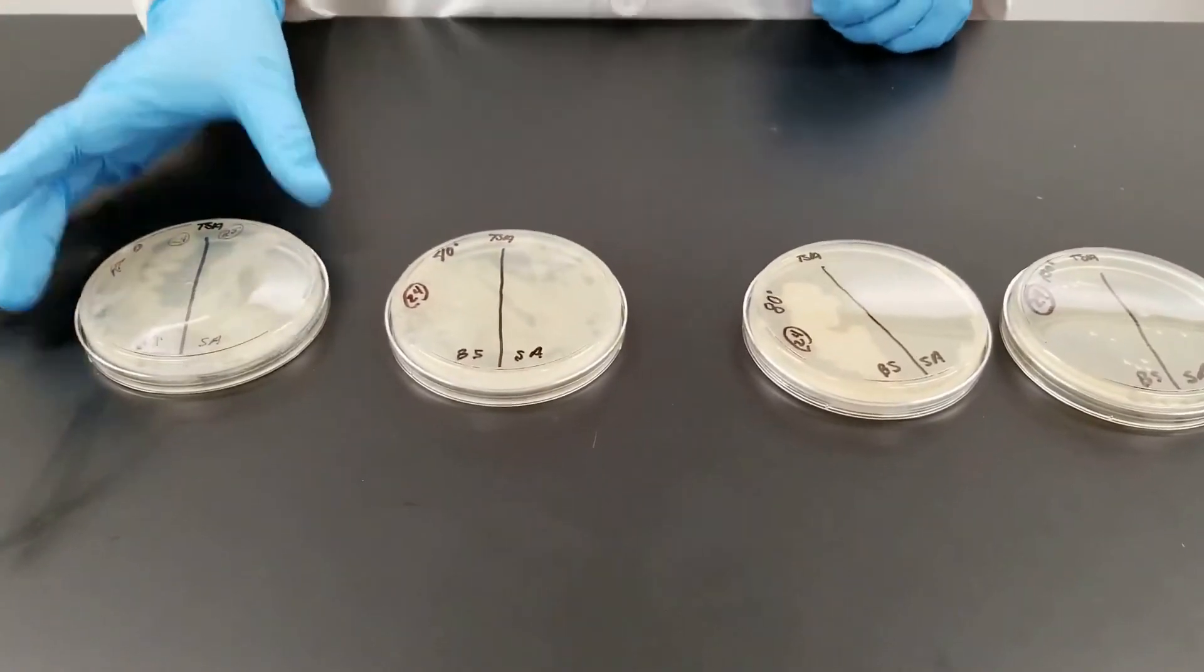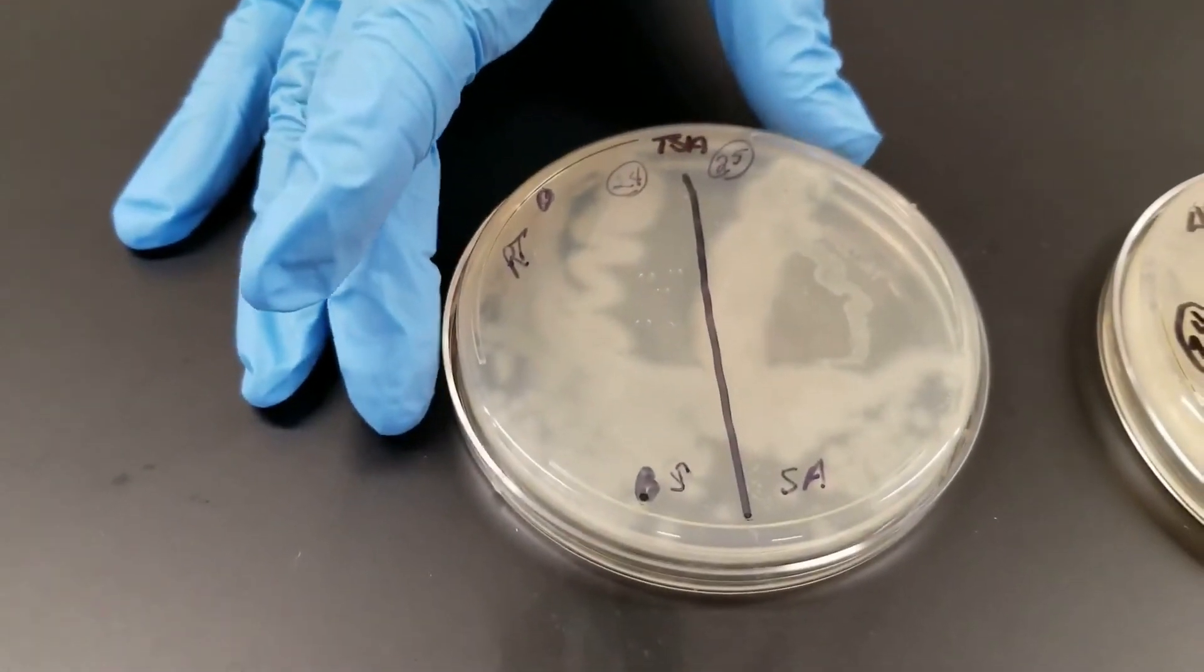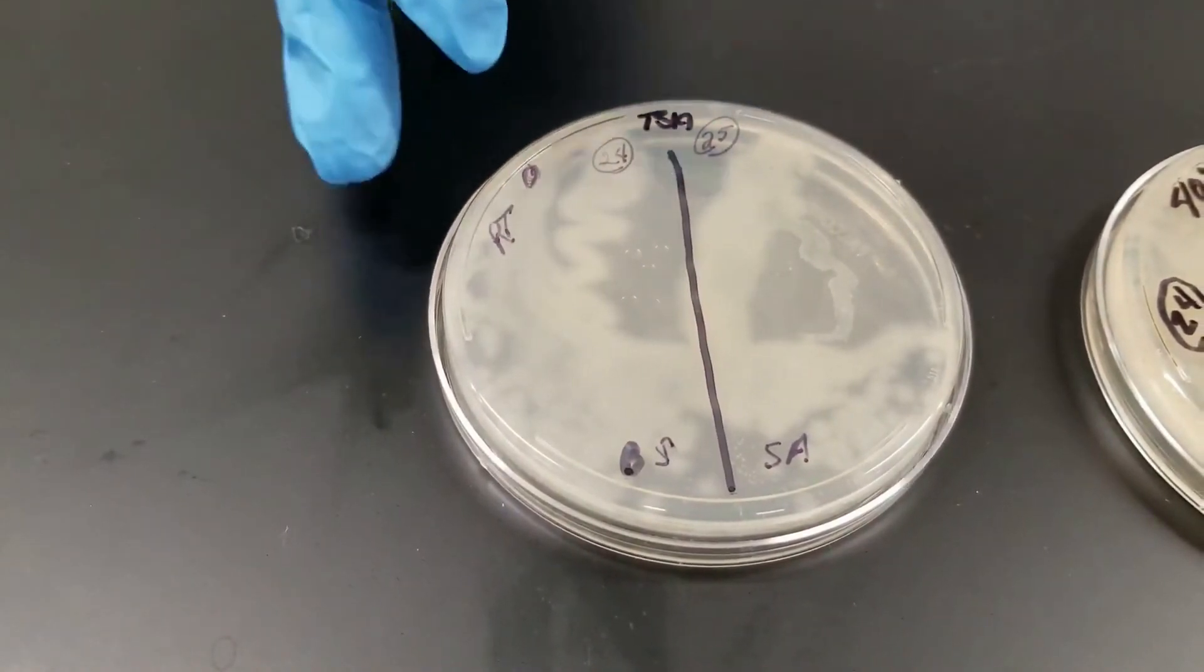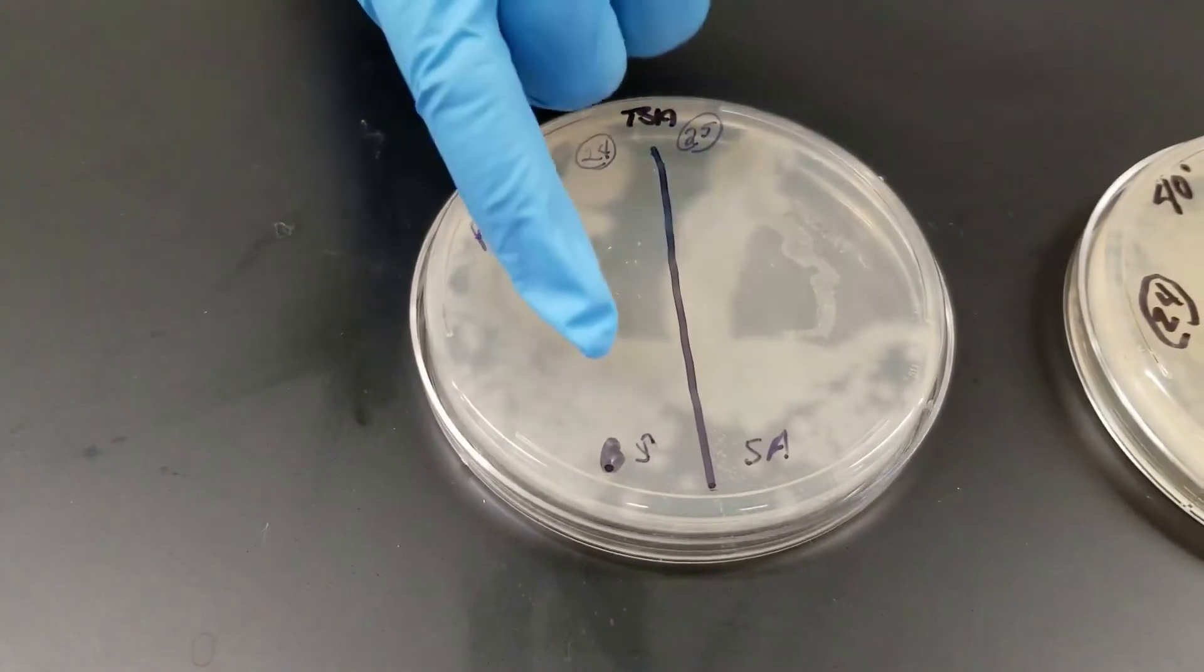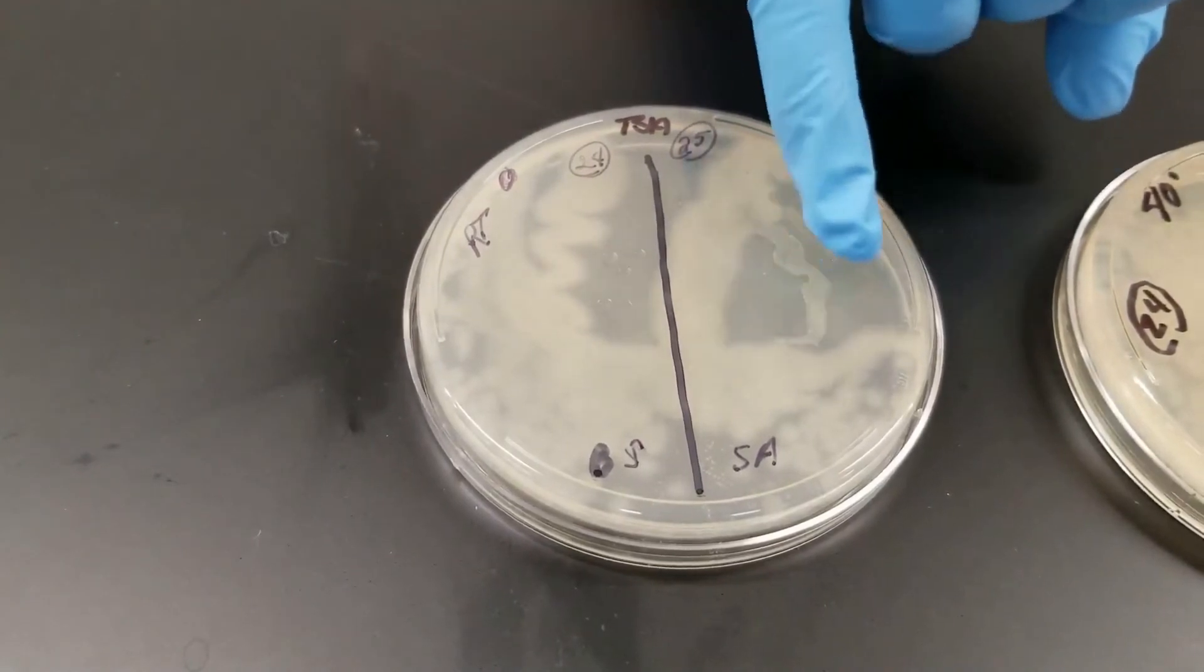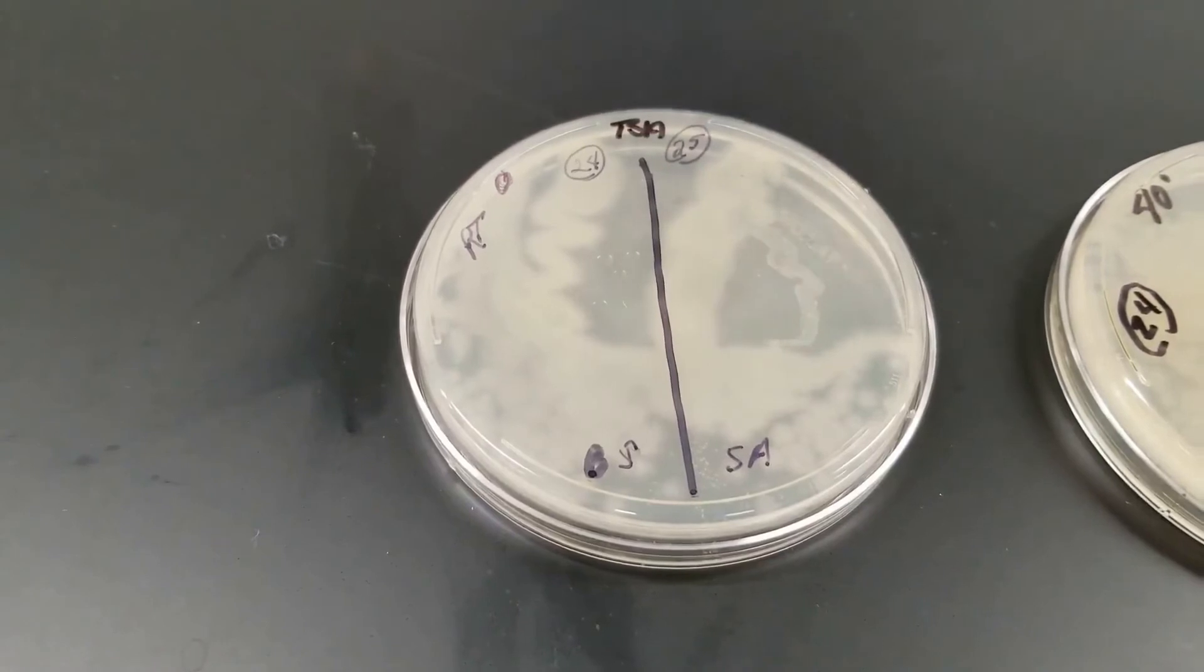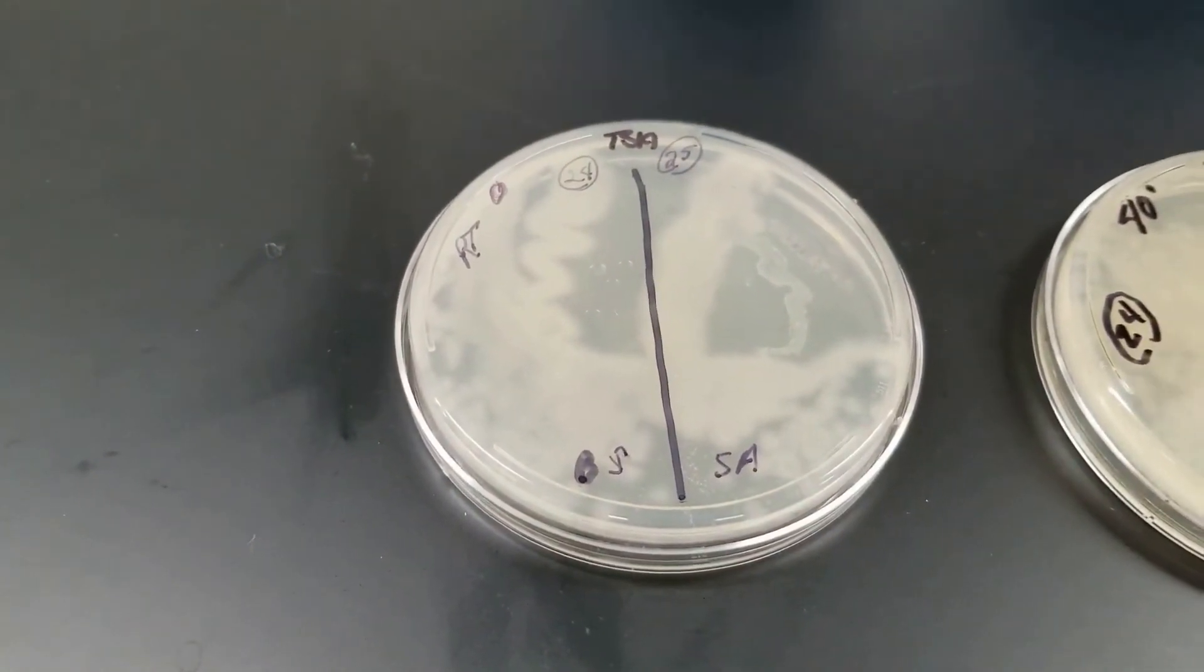This plate, if we start here, the cultures were grown at room temperature, and we inoculated the plate. As you can see, Bacillus subtilis is the thicker organism, and it did outgrow and compete against the staph aureus, which is this thinner line here. So there's some competition going on there. The Bacillus obviously grew much better, but they both grew well at room temperature.